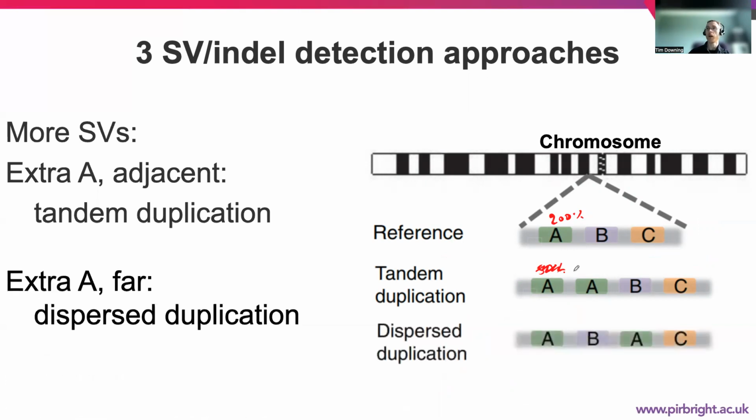We may have dispersed duplications as well from our sample, which creates issues with the reads that are mapping. We expect A into B, but not B into A, and then not A into C. So the B into A ones will not map here, because that's the 3' end of B mapping into the 5' end of A. So that will be a peculiar pattern.